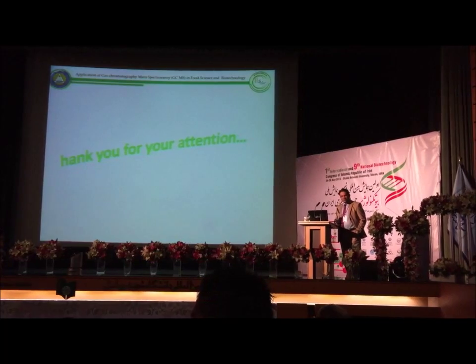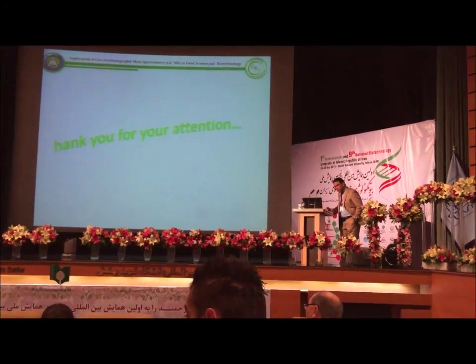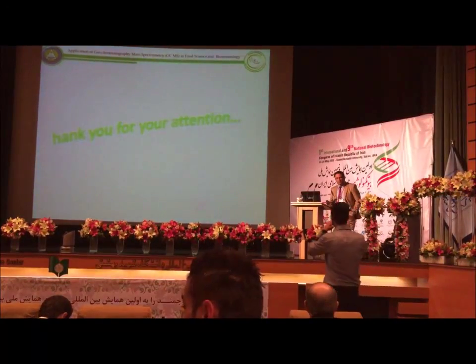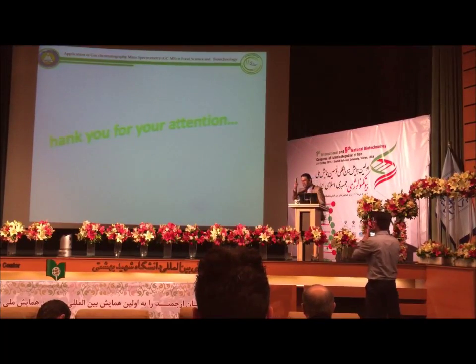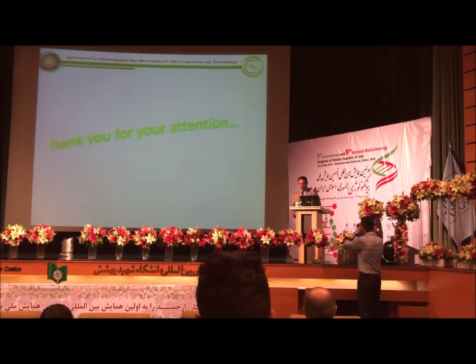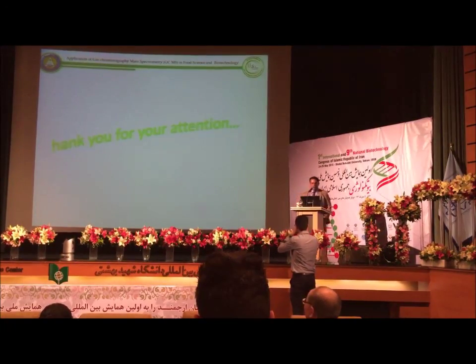Is there any possibility of detecting microbial volatiles online? I mean continuous monitoring, anytime. Anytime, yes, for example 24 times in 24 hours. Yes, we can. We can detect in 1 minute, or 2 minutes, or 3 minutes what volatile compounds are in the GC-MS. Yeah, we can. It's very easy.